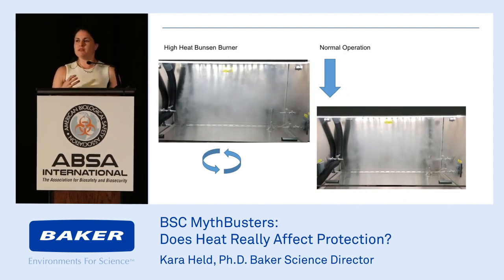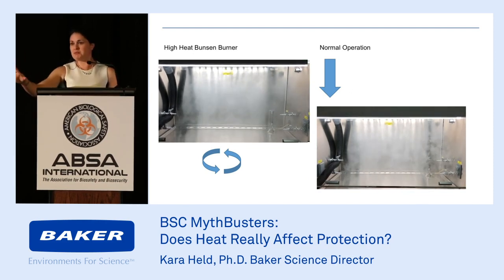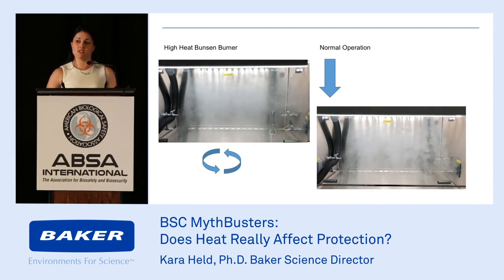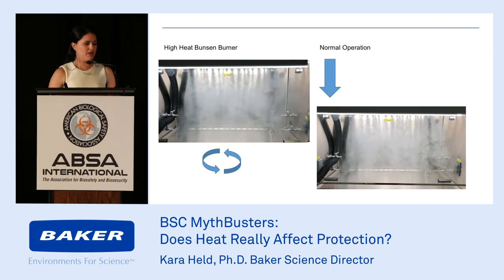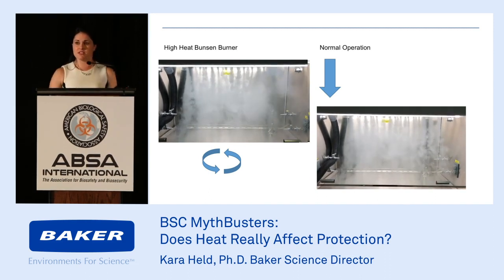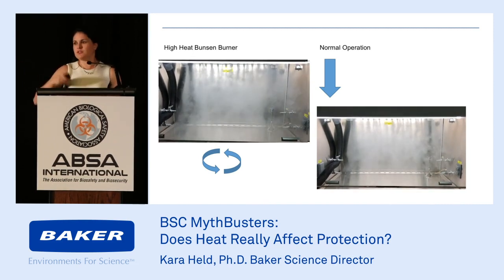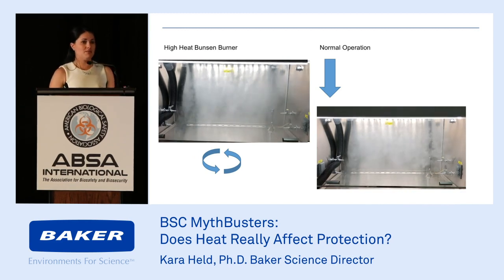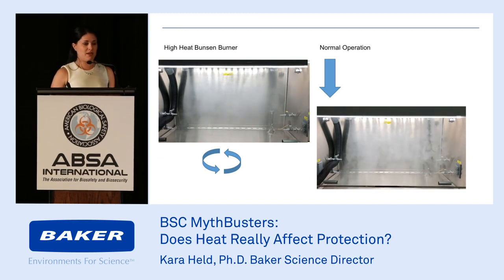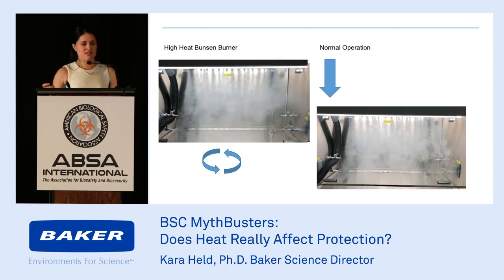We thought maybe not putting the Bunsen burner in the center of the cabinet would make it better. So if we tuck it in the back corner, maybe it'll be safe there. So we have the burner in both cabinets, but it is off in the lower movie. So you can see the air swirling around the off Bunsen burner, but you have a nice steady airflow next to it. When you turn the burner on, there's huge swirls of air that extend even past the midway point of the cabinet. See, this is extending a lot further away than was anticipated. Also, this is a 6-foot cabinet. It's quite a large distance.